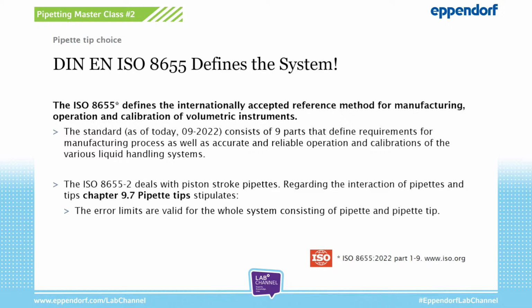Calibration labs are currently in a transition phase from the previous to the new ISO 8655 version, which comprises a total of 9 chapters as of today. And part 2 deals extensively with air cushion pipettes. However, pipette tips are also so important that the new ISO 8655 standard describes pipette and tip to be a system. The error values are only valid for this system.